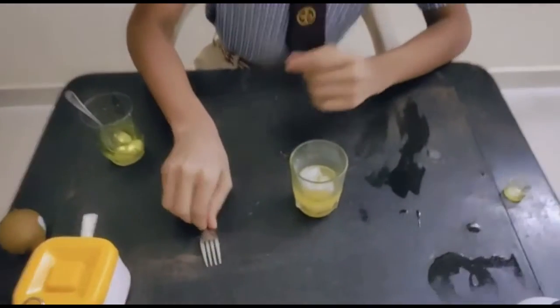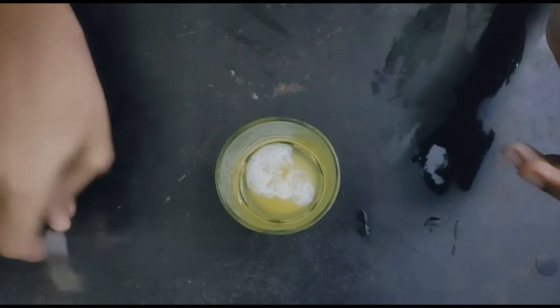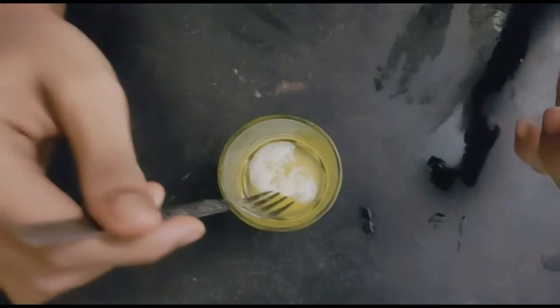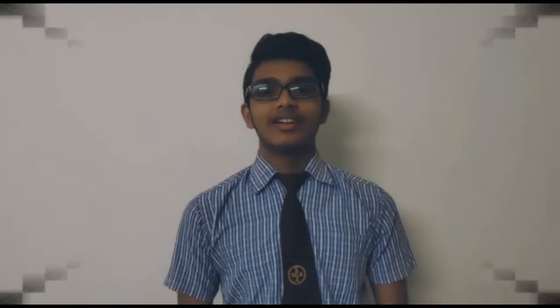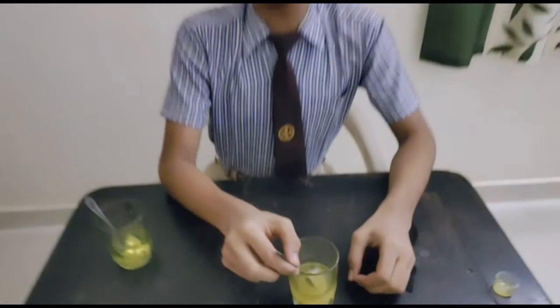After some time you can see the blueprint of life floating in the solution. The alcohol added extracts the DNA from the kiwi, and it floats very clearly as you can see here. This is the DNA of the kiwi. The detailed structure of this DNA can be observed through a microscope and it will look like this. Hope you all enjoyed this and will also try this at home. Thank you.